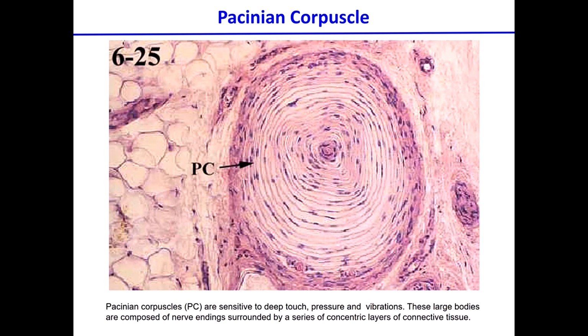So this is not a myelinated neuron, just in case anyone thinks that would be the case. And anyone will say, why not? First hint, why is this not a myelinated neuron? You see more than one nucleus around the center, which is the nervous cell?